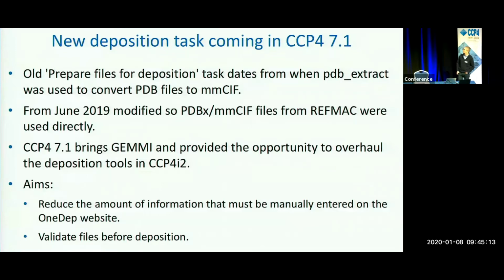And a lot of this information is stored in the database in CCP4i2, so if we can add that automatically to the file before we deposit it, that will save a lot of time, and also should improve the quality of the statistics that are deposited with the structure, and also to validate files before deposition.